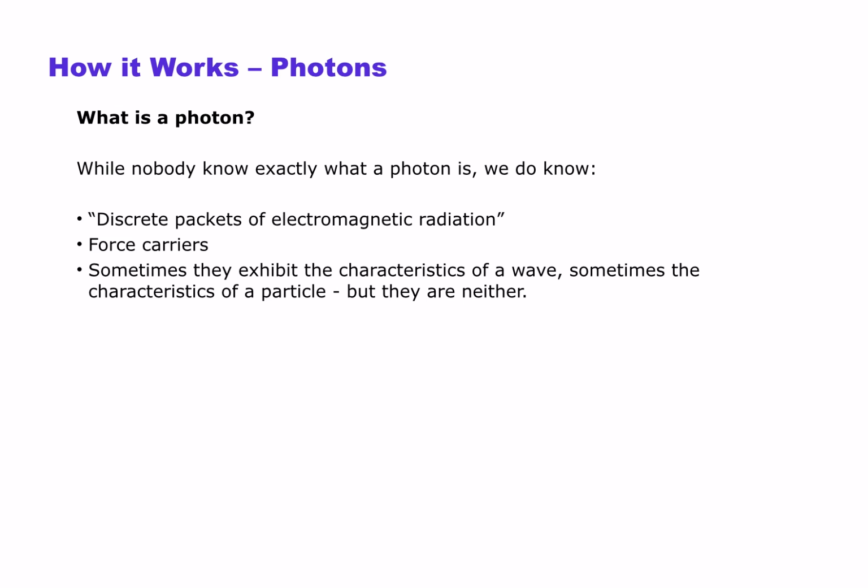Sometimes photons have the characteristics of a wave, sometimes a particle, and they are neither. And I must stress, they really are neither. I know lots of instrumentation reports results in wavelength, but it's important to remember these are models we have for the way photons interact. We don't exactly know how they are. And the wavelength model can only take you so far. This is one of the reasons why you typically see electron volts reported whenever you see characteristic K alpha or L alpha peaks of elemental fluorescence.